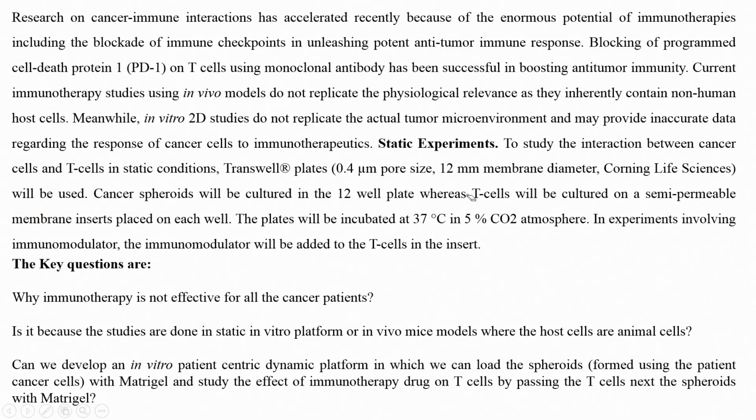Cancer cells can be cultured in a 12 well plate, where T cells can be cultured on semi permeable membrane inserts placed on each well. The plates are incubated at 37 degrees, 5% CO2 atmosphere, right.